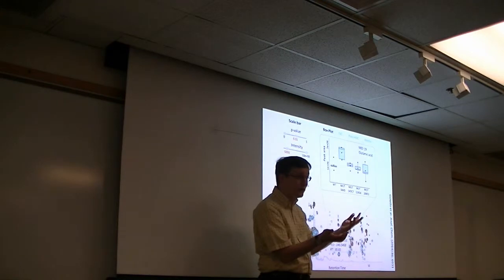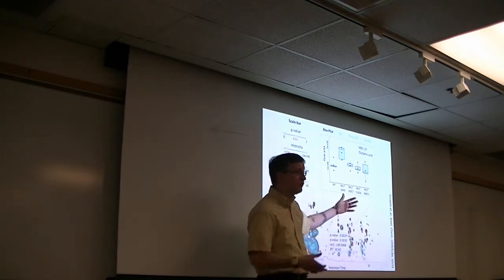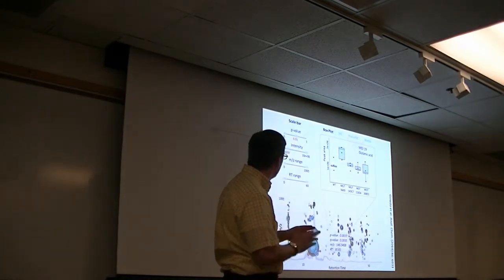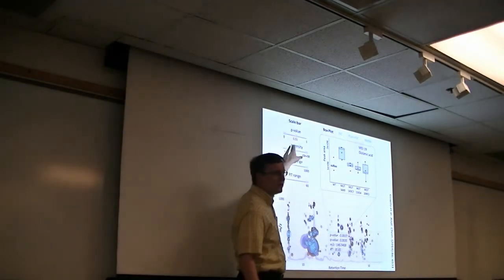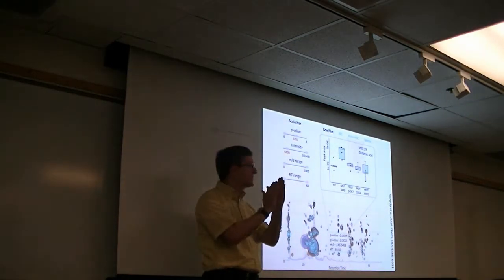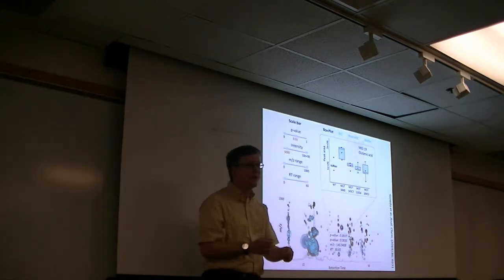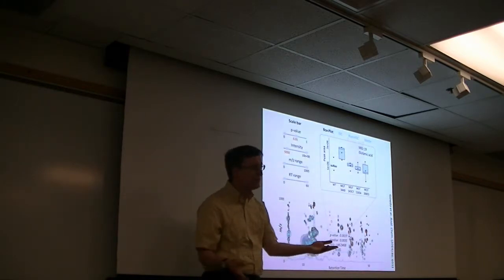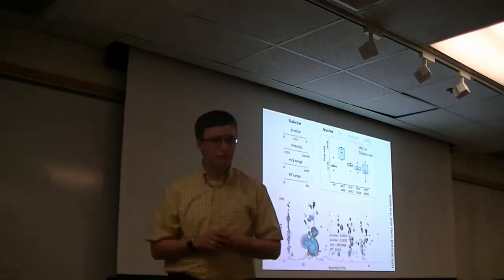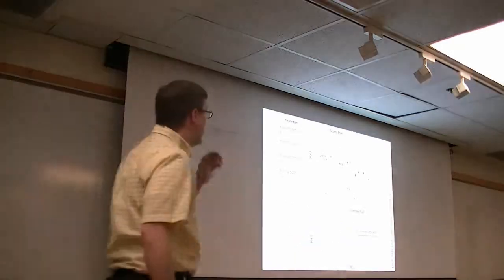So this is an interactive chart. By clicking on one of these globes down here, I'm going to get that particular metabolite's raw data represented in this kind of way. All right. So here you can see that you can set what the critical thresholds are for different features. And it may be that your interest lies only within a narrow M/Z range or within a narrow retention time range. So having seen a blob show up in all of the A's but none of the B's might draw your attention to that particular area. You can narrow down to figure out what exactly that looks like. Okay. So here we go.